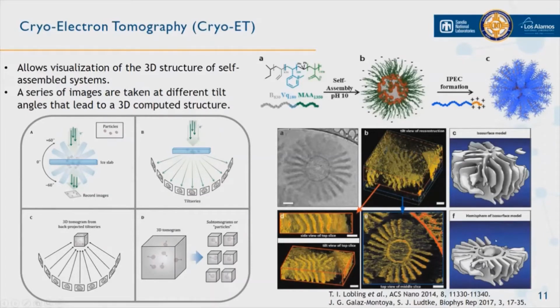And all of this would not have been discernible from the 2D projection. So with cryo-ET, because now you are taking multiple images on a single structure, control over the electron dose is important. This is in order to reduce sample damage throughout the tilt series and to ensure that artifacts are not introduced into the system.